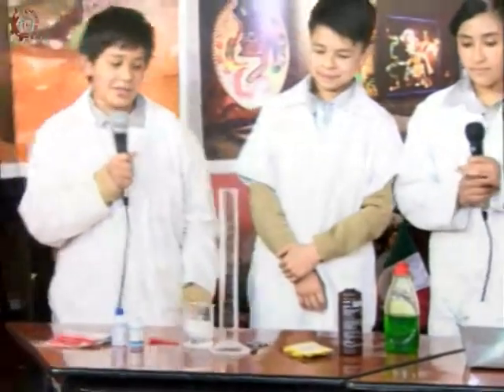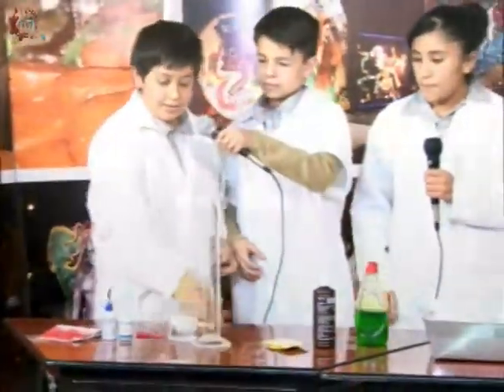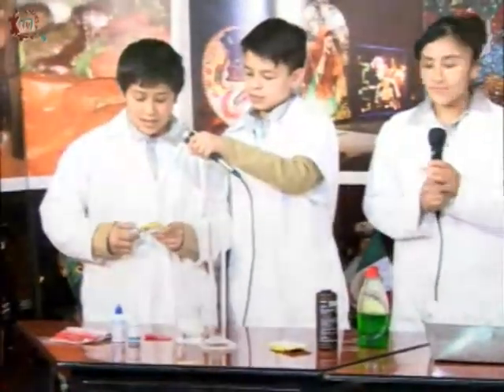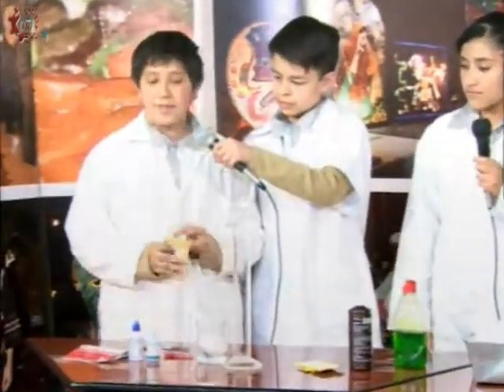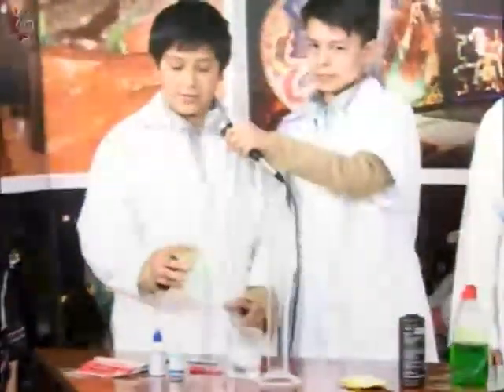Lo primero que tenemos que hacer es abrir la levadura. Para eso necesitamos la levadura, obviamente, las tijeras. En este sobre lo que hay es levadura seca. Y cuando la echas en agua, cuando se hidrata, se activa y empieza a, se puede decir, como revivir.